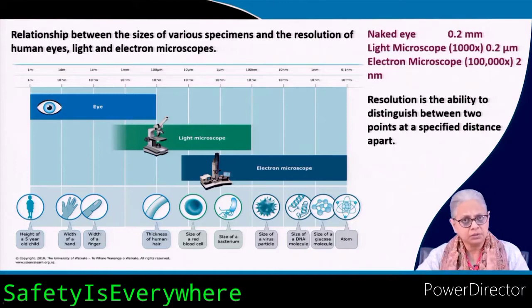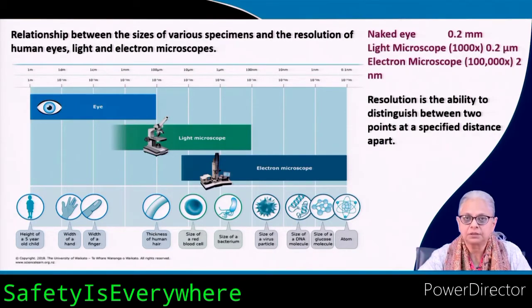Schools and colleges generally have it; it's relatively easy to find. It's not in the lakhs, it's in a few thousands of rupees and so on. So it's relatively expensive, but not impossible for schools and colleges to have, right? We do have some other light microscopes as well. I will talk about them later, but it's safe to say that most of these microscopes have an upper limit in terms of magnification of 1000 to 1500 times.